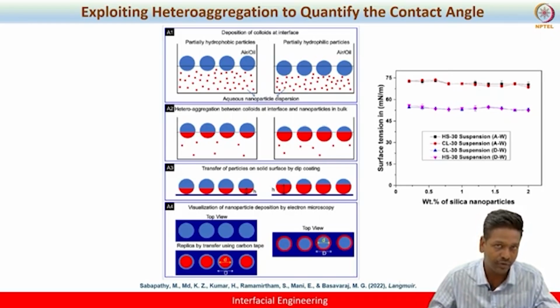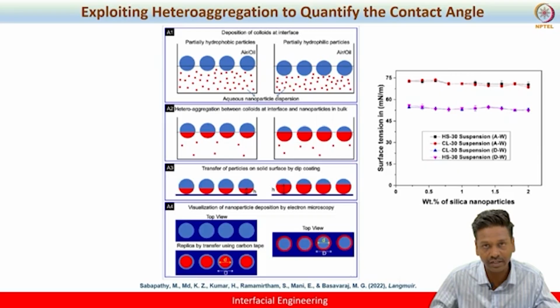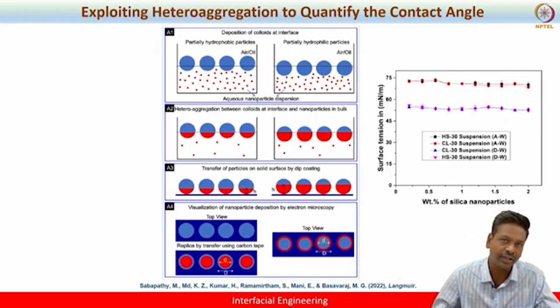The particle that we have demonstrated is the amidine functionalized polystyrene particle, right? So in such a case, you would expect the particle to have a positive charge, right? So the technique that we have demonstrated will only work for such particles, right? What if the particle is negatively charged?